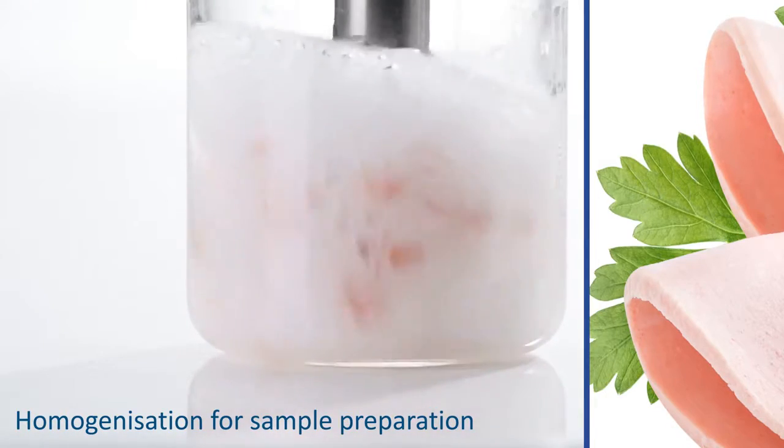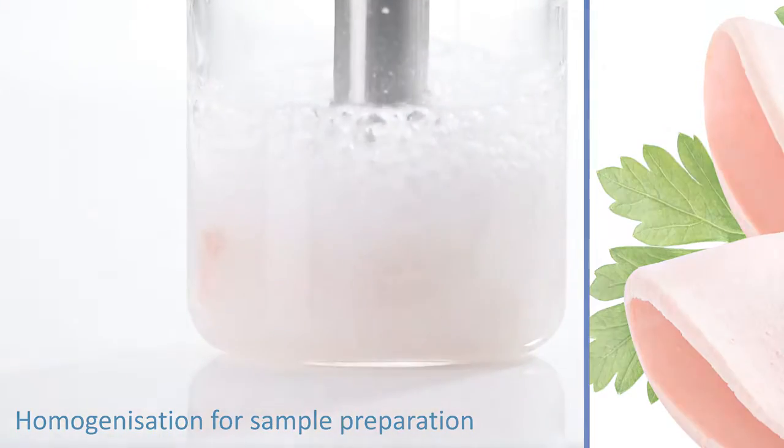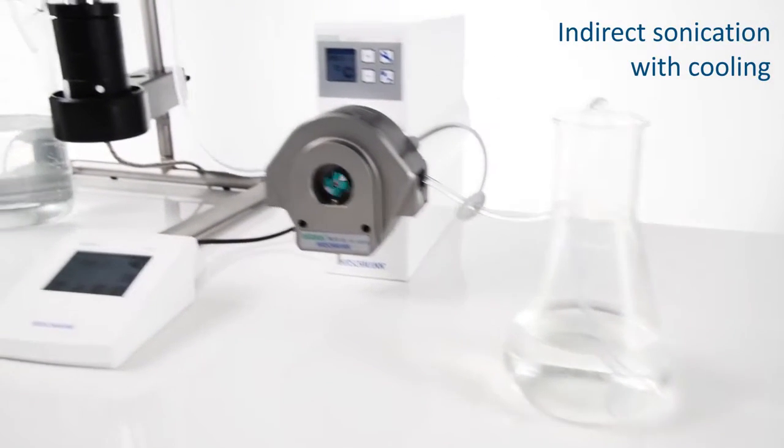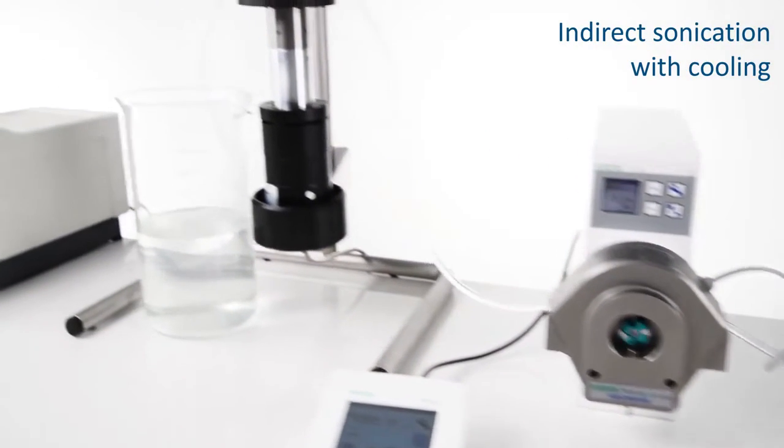Bandolin provides market-leading ultrasonic technology that perfectly equips you for all homogenization tasks. Thanks to a broad selection of perfectly coordinated accessories, you can create various types of compositions.